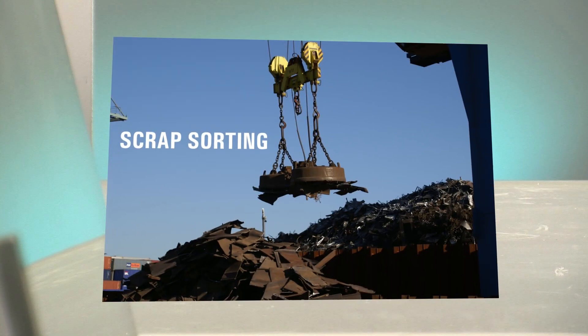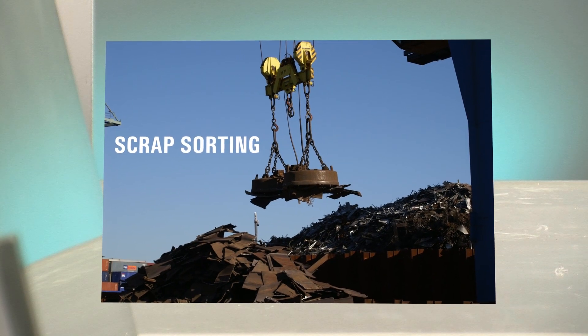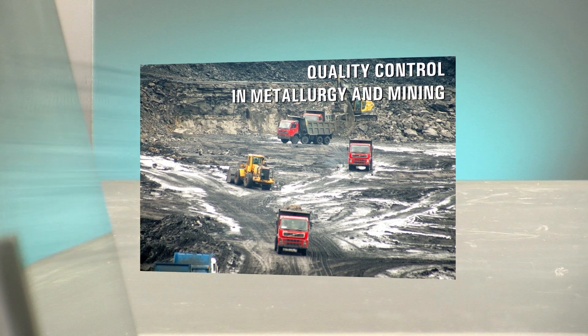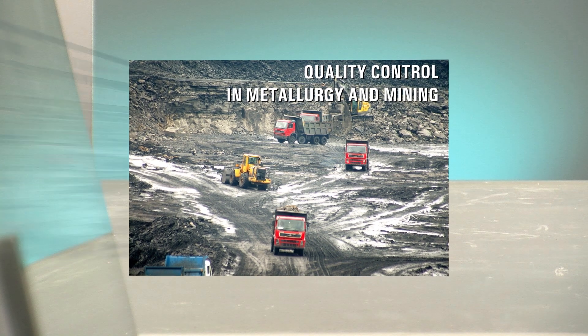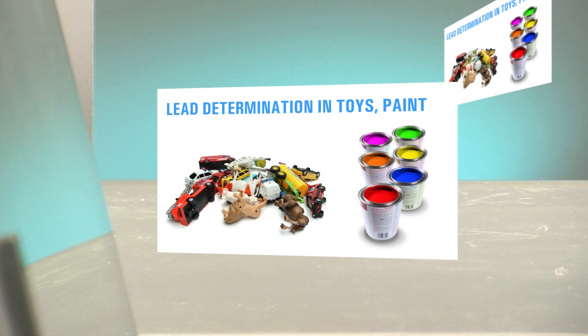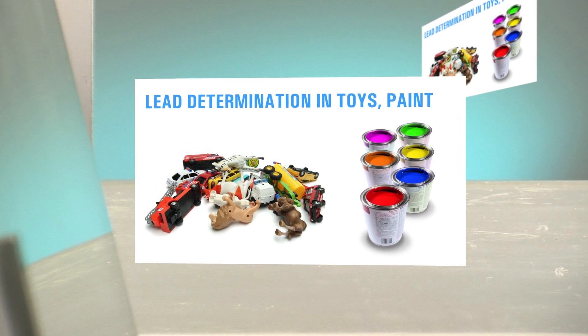Light and rugged, it can be used for a multitude of tasks, such as scrap sorting, quality control in metallurgy and mining, lead determination in paint, toys, furniture and clothing, RoHS compliance testing, art and archeological inspection, and numerous other applications.